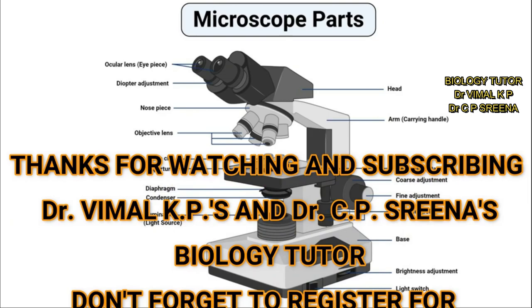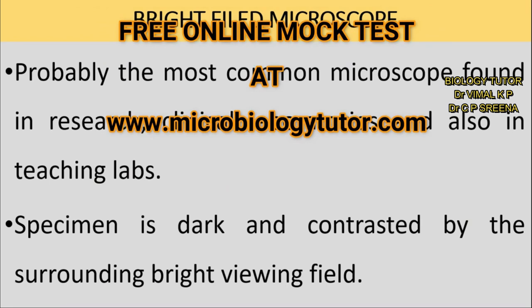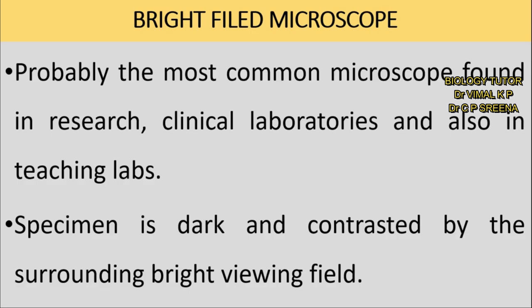Bright field microscope. Probably the most common microscope found in research, clinical laboratories, and also in teaching labs is the bright field microscope. Specimen is dark and contrasted by the surrounding bright viewing field. That is a peculiarity of bright field microscope. Field is bright.